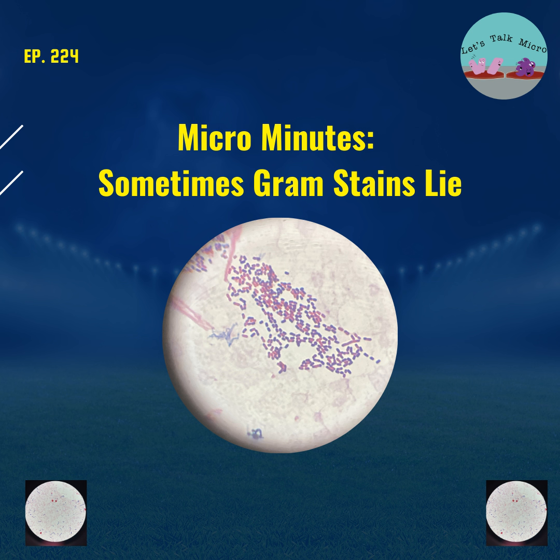And I'm going to wrap the episode talking about Pasteurella and Haemophilus, but before I do that, let me quickly recap some things that can affect your gram stain. One is the age of the culture or the sample. Another is antibiotic usage. And of course, decolorizing, either under or over. That's a big factor that can affect the results of your slide.